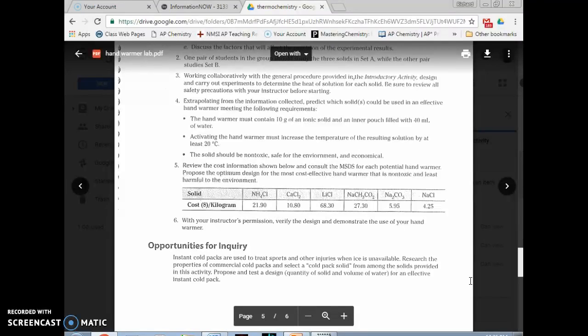We had an issue, and you guys that all had the lithium chloride, apparently the lithium chloride had been exposed to way too much air. So the lithium chloride should have been better than it was. And learning a lesson there. To save a little money, I try to buy chemicals in bulk, but some chemicals, once they get exposed, they're pretty much worthless. So what I've been doing lately is buying smaller amounts just for the lab that I'm going to need, because typically I won't use it anymore, at least for this kind of a lab, unless I needed lithium ions for something else.